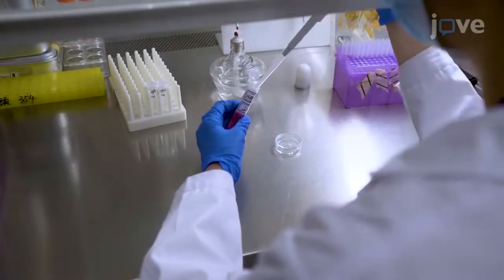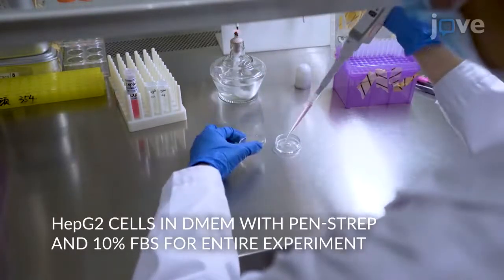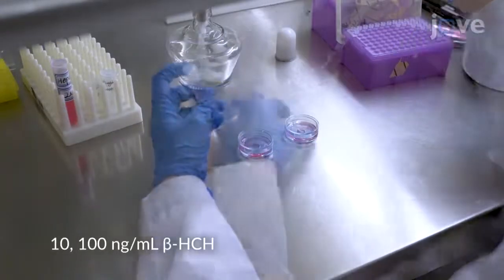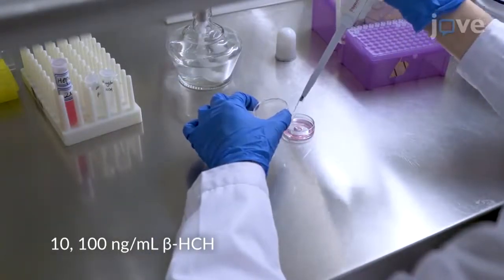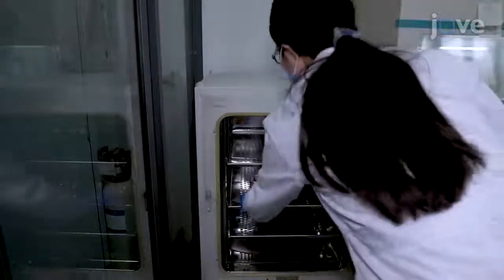To start this experiment, seed 20,000 HepG2 cells in a glass-bottom petri dish. Add beta-hexachlorocyclohexane, or BHCH, and incubate at 37 degrees Celsius and 5% CO2 for 24 hours.